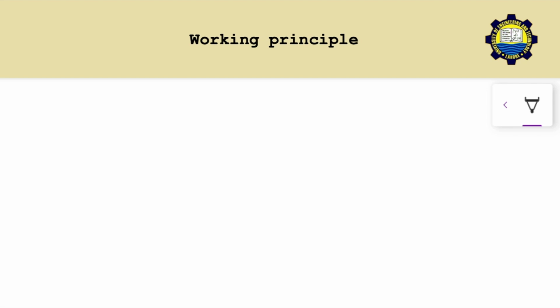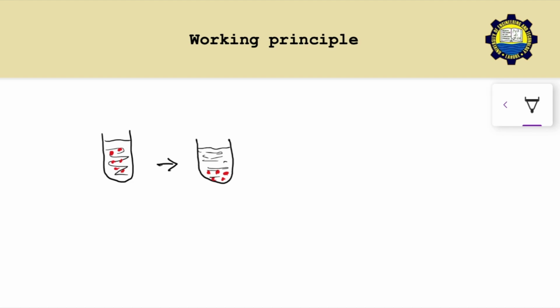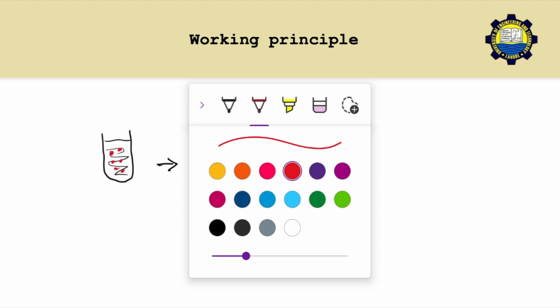So we've understood that the particles are suspended in a liquid medium, and they're placed in a centrifuge tube. What we see at the top, which is the liquid part or the less dense part of the mixture, is called a supernatant. And what we see at the bottom, the denser part of the solution, is called a pellet.